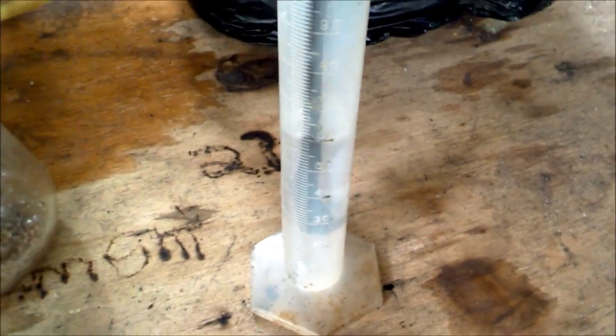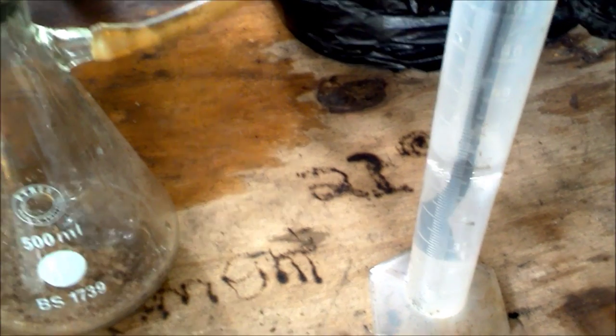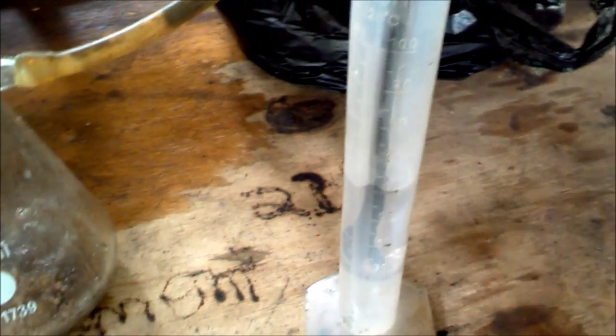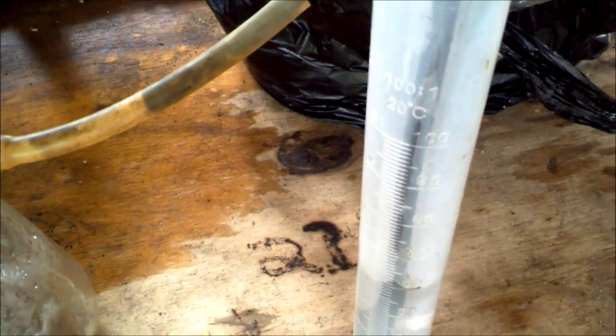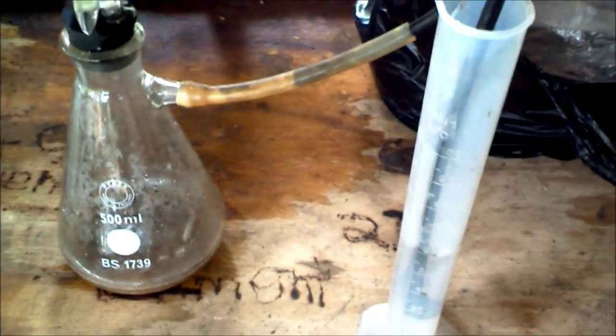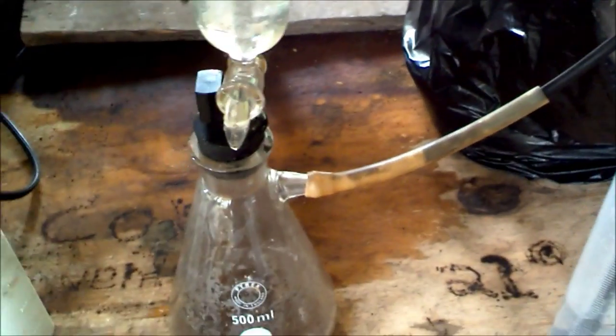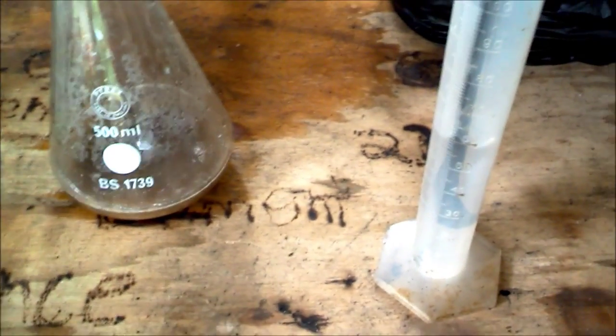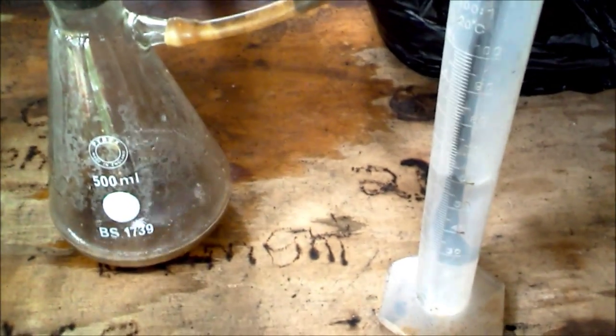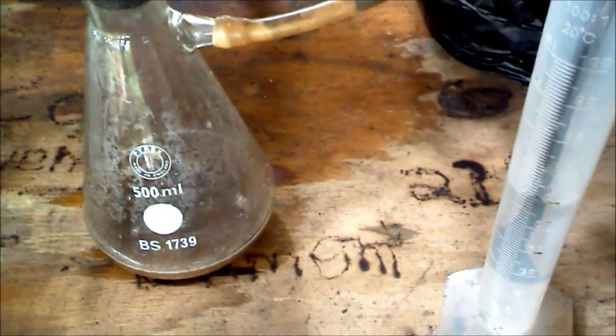As you can see, ammonia has begun to generate. Be sure to do this outdoors because ammonia can be poisonous in high concentration. The generation is getting a bit slower. Heating the flask will also cause more ammonia to form.